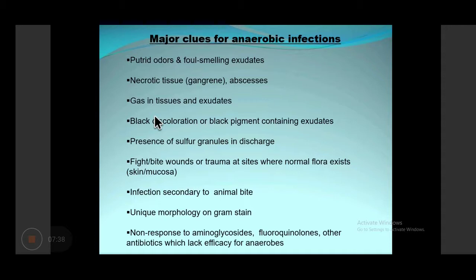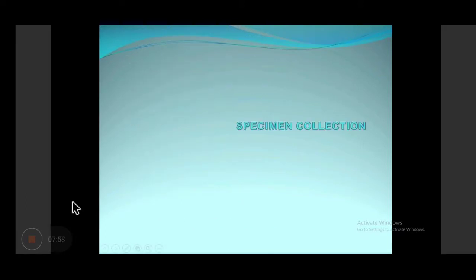So first you should know the reason. Then what specimen? Anyone, please, suggest one or two probable specimens. Yes, good. There are many reasons for aspiration: coma, infants, surgery, old age, immunocompromise, altered consciousness, endotracheal tube insertion. Thank you, good. So what are the probable specimens? What specimen will you suspect?